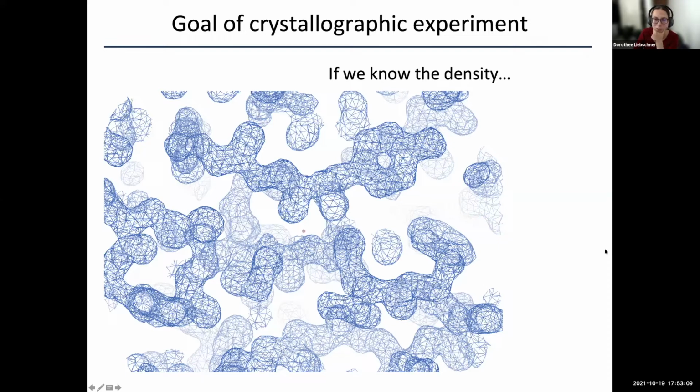Okay, we have already an answer. Okay, and we have a few already. We have tyrosine. Most of you suggest tyrosine, and then benzene, right? So we know this is a protein, so we maybe expect tyrosine here, but it could also be some ligand that has a benzene ring. So both answers are basically correct here.